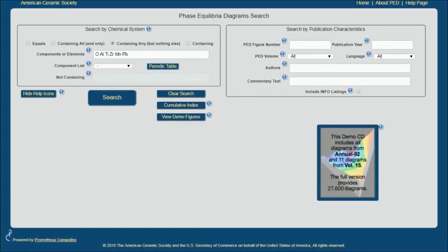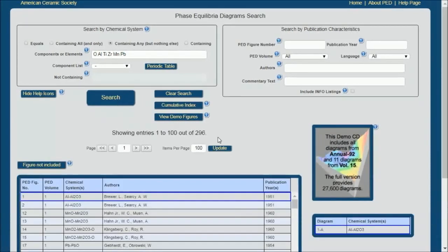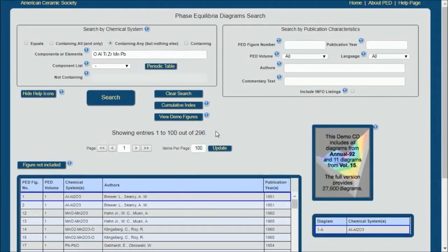containing any but nothing else, which means it will call up Phase Diagrams that contain any of these six elements but no other elements. Once I've done that, you'll see I still get 296 Phase Diagram systems.